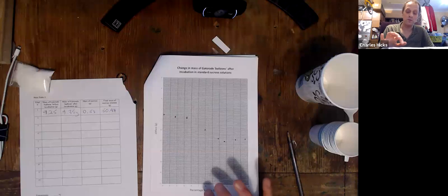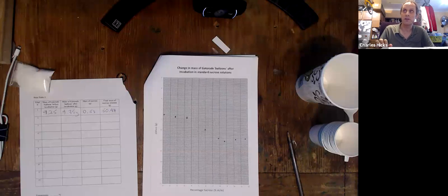In the post lab, after you determine that percentage, you're going to be asked to convert that percentage description of concentration into a molarity and then use the equation that's normally used to calculate osmotic pressure to calculate the osmotic pressure of the solution from the molarity that corresponds to that percentage.